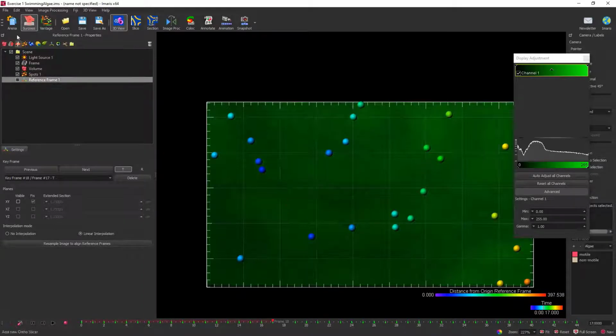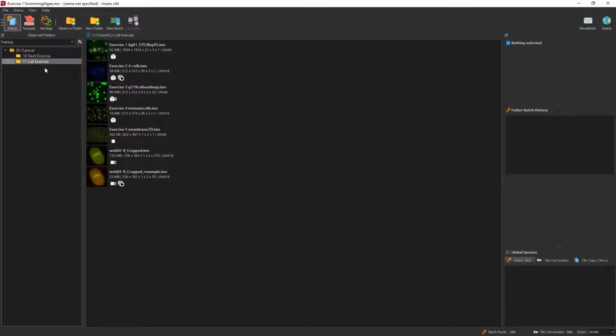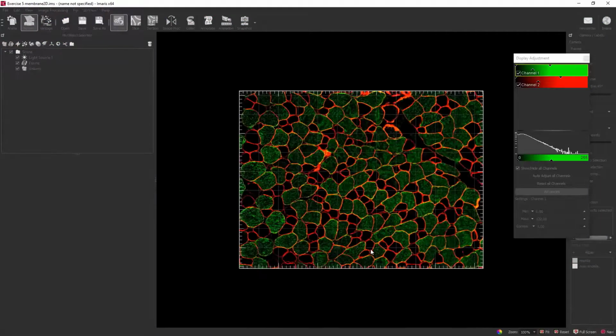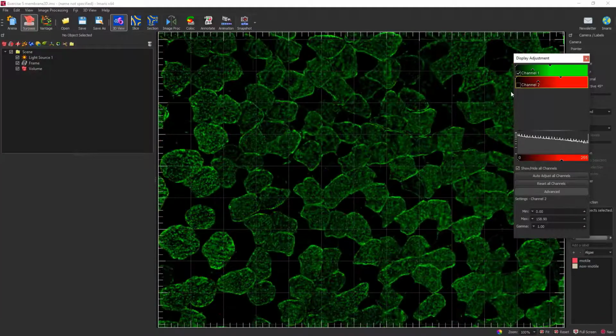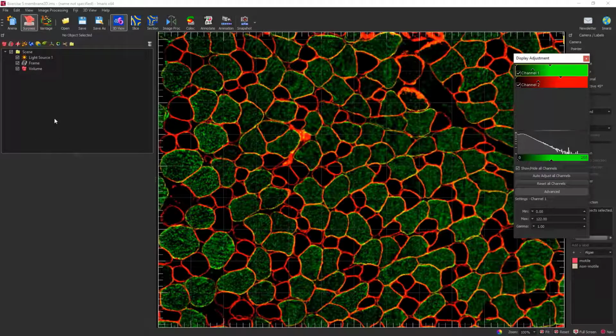Yeah, so it all comes back to Nyquist. I don't know if I have a good example here of some really thick cells, but I haven't tracked this one yet. Even cells that are really scrunched together, the key is going to be your object detection, right? What you need is to be able to resolve your objects as separate entities. So we can come in here and either use the membrane detection like I used before, or use the spots, or use surfaces using seed points to split apart your objects.